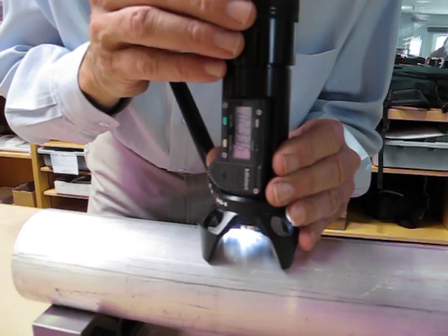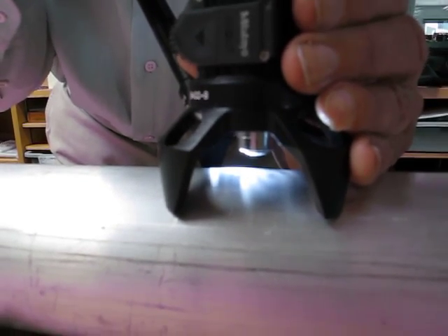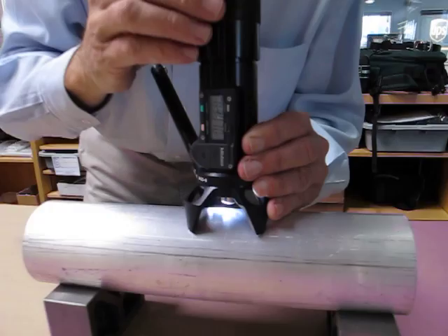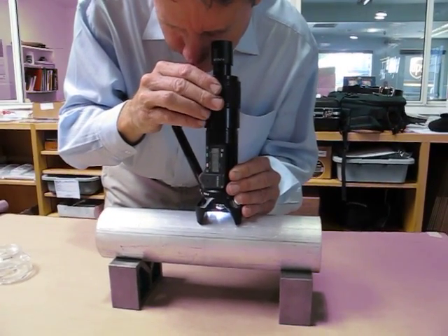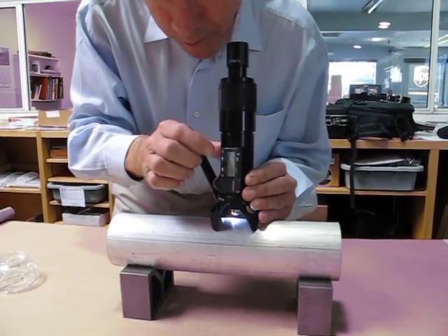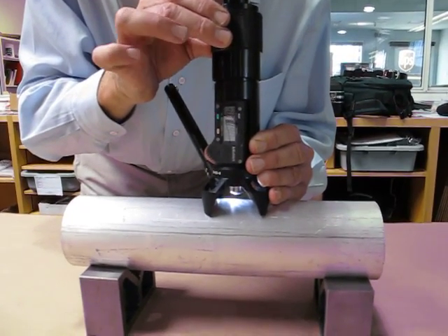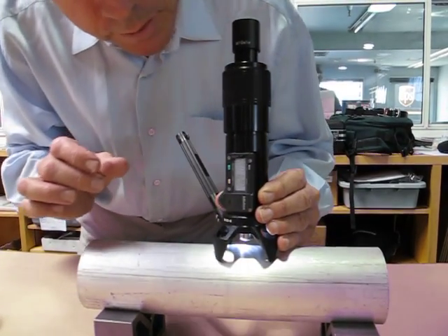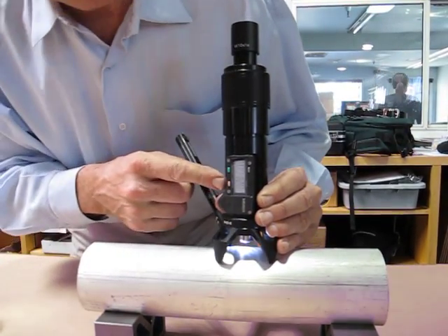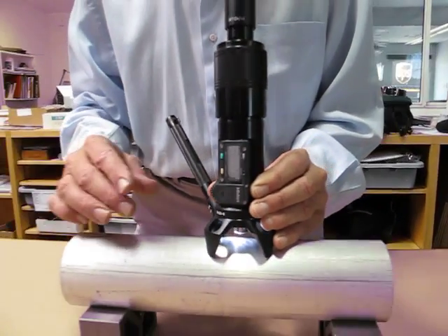I'll try to find a defect on here. I'm going to focus again on the good surface next to the scratch and set zero. And then focus down in. This one looks a little deeper, and that looks like twelve thousandths of an inch deep.